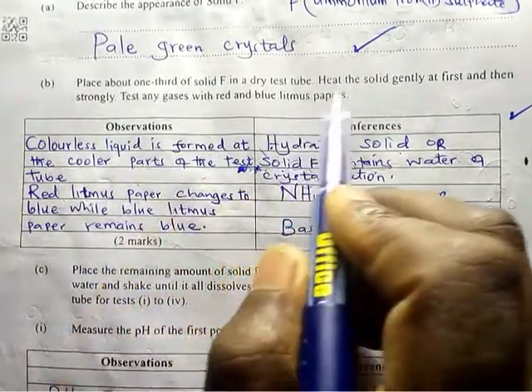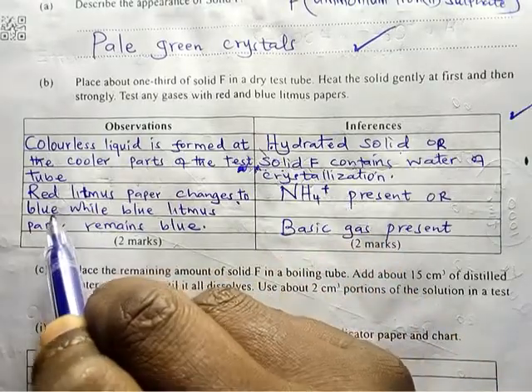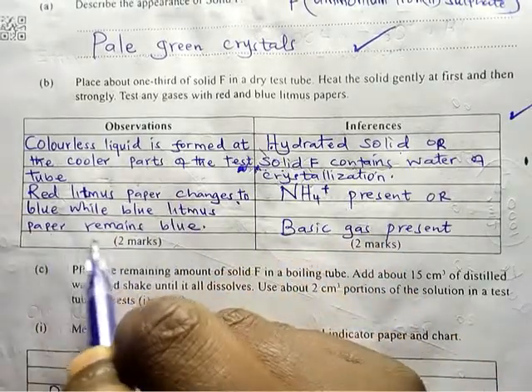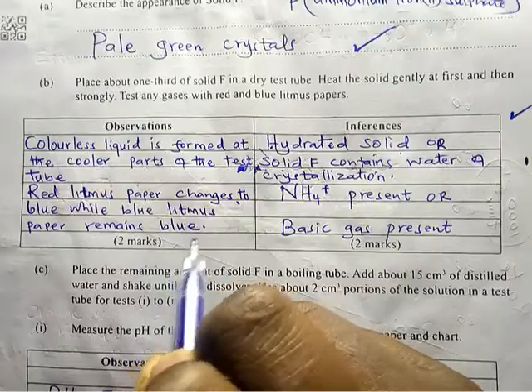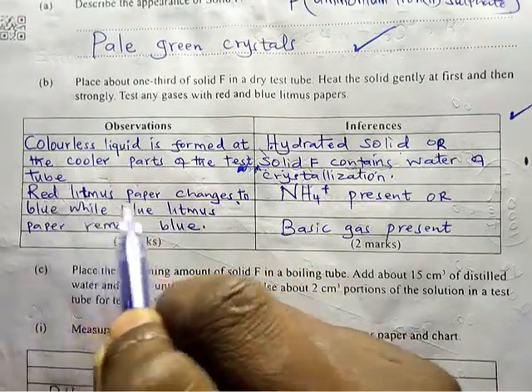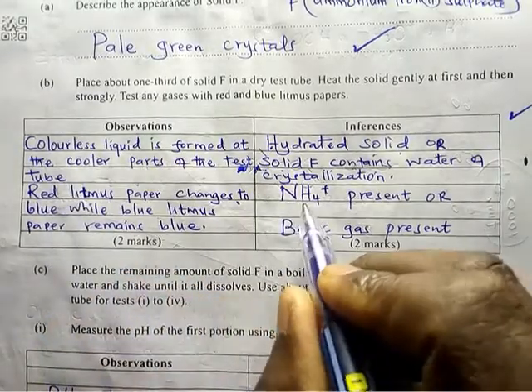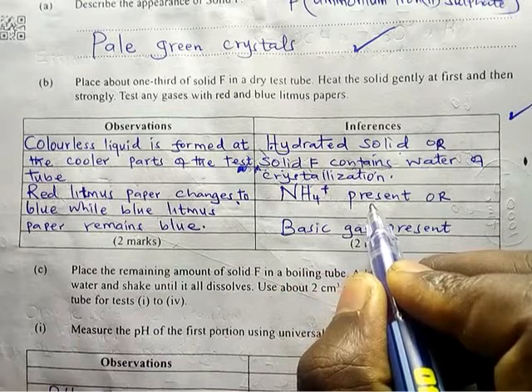Then what happened to the litmus paper? Red litmus paper changed to blue, while blue litmus paper remained blue. That means the gas that was produced, which changes red to blue, is basic. So it means ammonium ion is present.